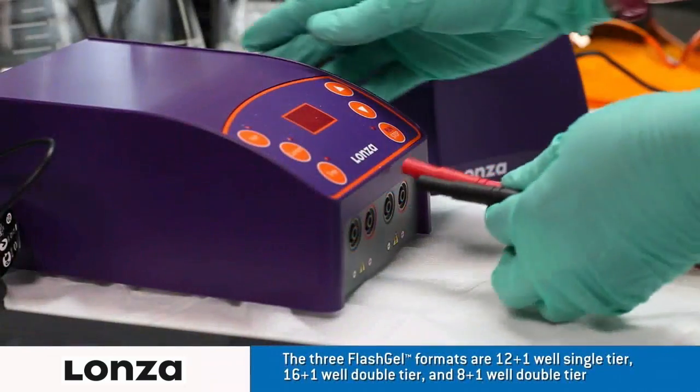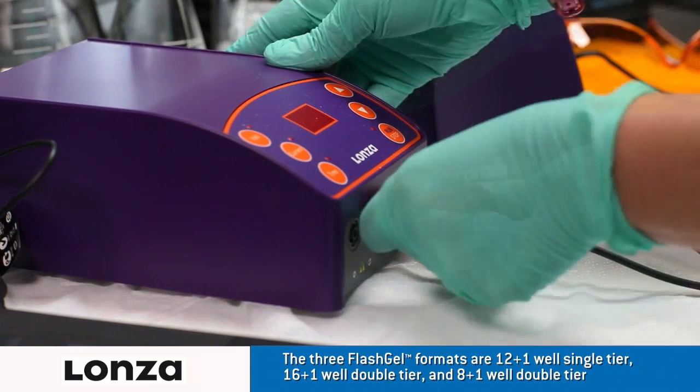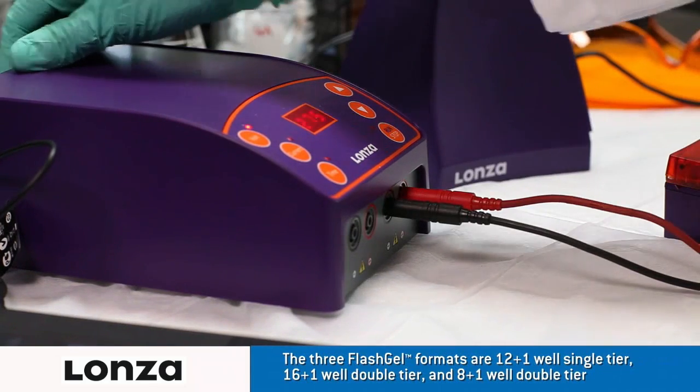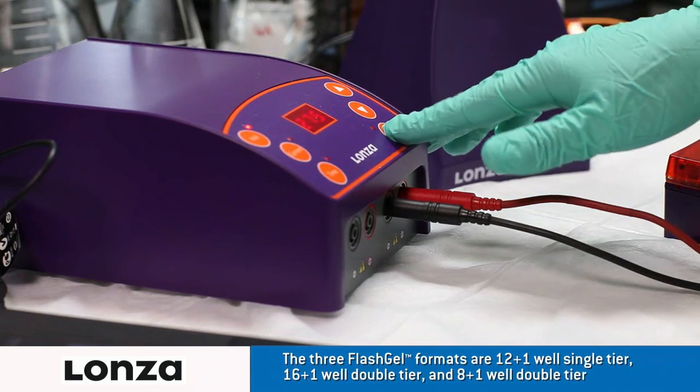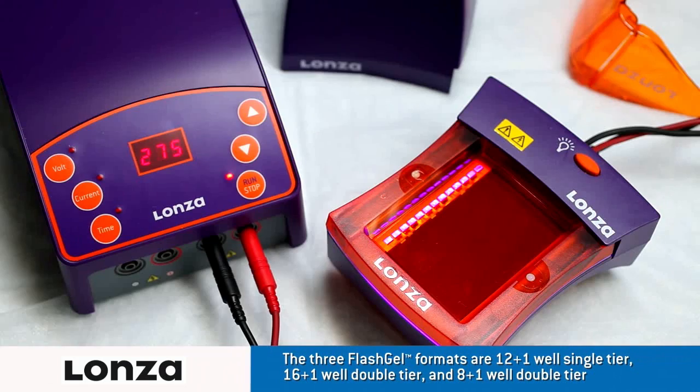Plug in the electrodes to the power supply. Turn on the FlashGel dock and then the FlashGel power supply and set to run at 275 volts. Band migration is visible within the first few minutes. Watch the real-time separation with outstanding sensitivity and resolution.